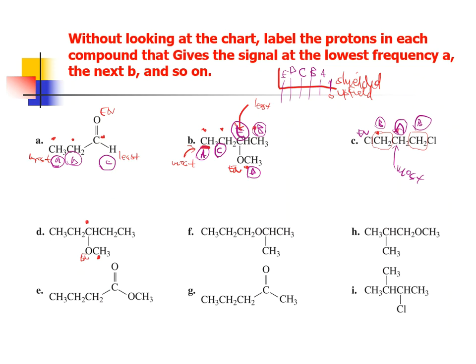Now I'm just going to move left-handed because I'm a left-handed person. That's right, I'm sinister in the world of organic chemistry. So if I go to the left-hand side, this is a CH2 group. That's different than a CH. That's different than a CH3. So, ding dong, I'm going to get it there. But, guess what? If I go right-handed, I see another CH2 group.